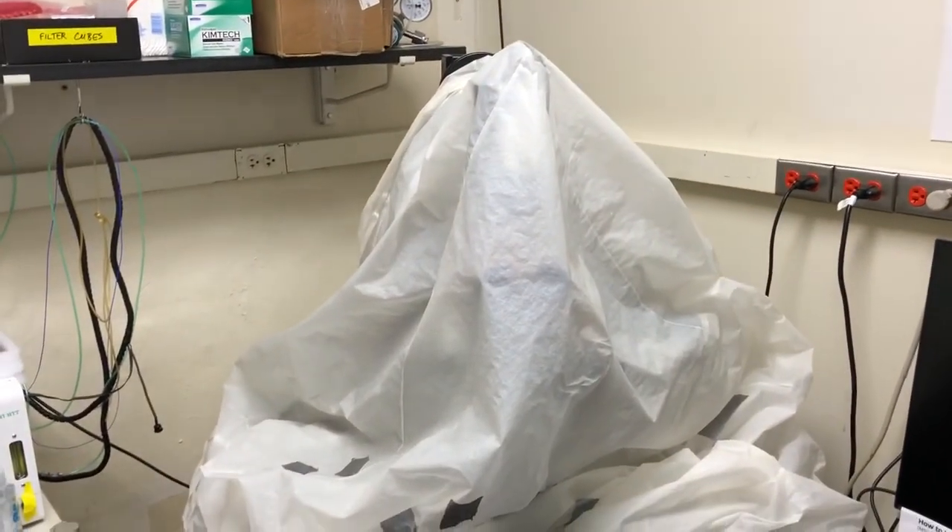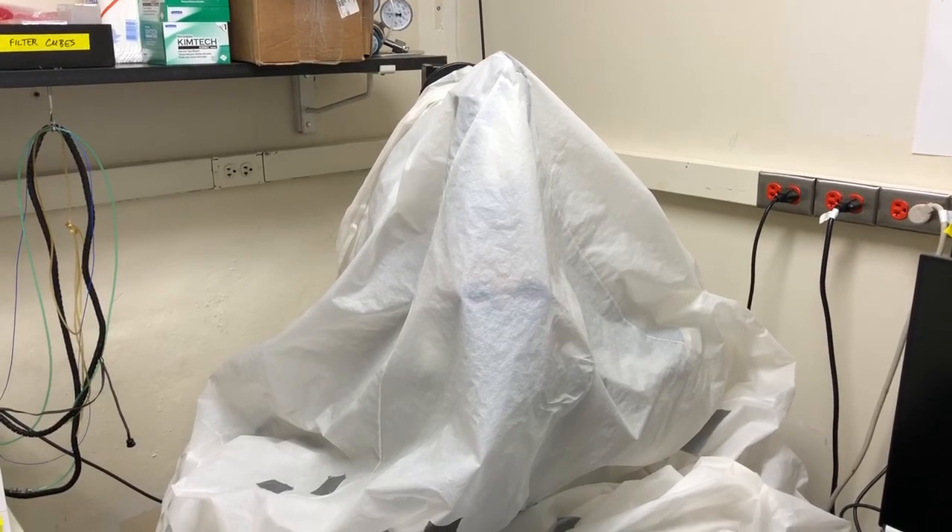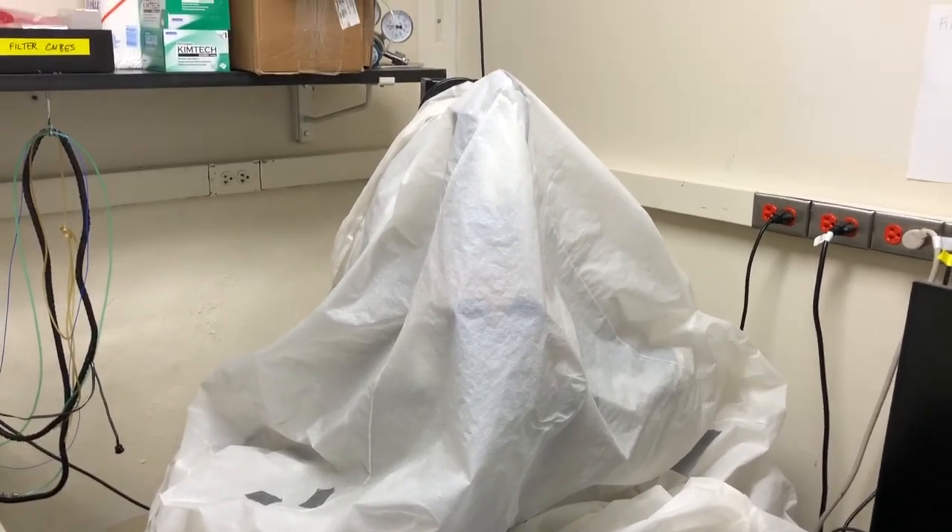The purpose of this video is to explain how to use the IX-81 or LUNA microscope to acquire bright field images.